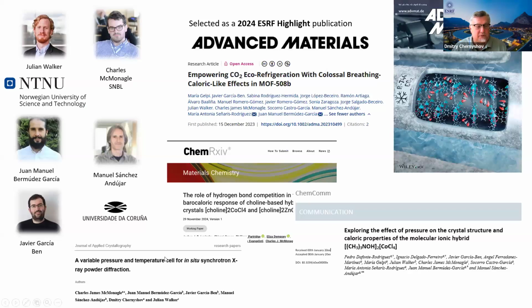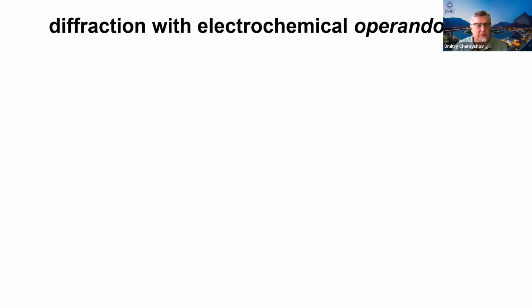The group of users which are mostly focused on data are shown here. We have more experiments from other user groups, and those are just the first papers which appear, and more to come. So they show how a very simple device, or something which seems simple, let's say, don't look at the details, opens new options and attracts many users with materials for the barocaloric and the like applications. So a similar example is about electrochemistry.